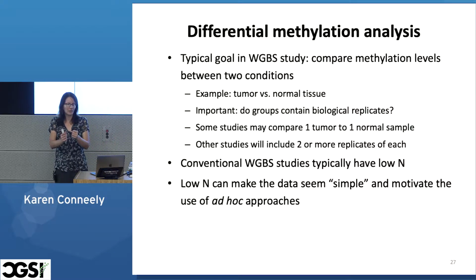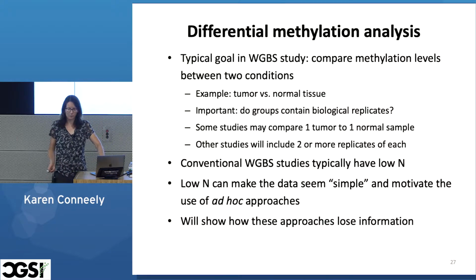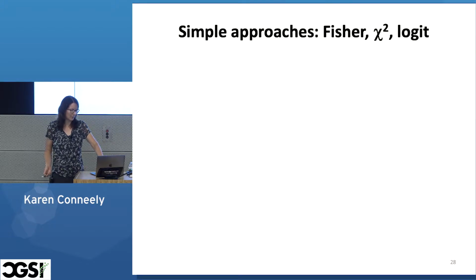It's simple, I can understand it. I know how to do a Fisher's test, I'll just throw it in the Fisher's test. And that could be useful for a first pass, but I'm going to show how these approaches lose information and talk about some other approaches.